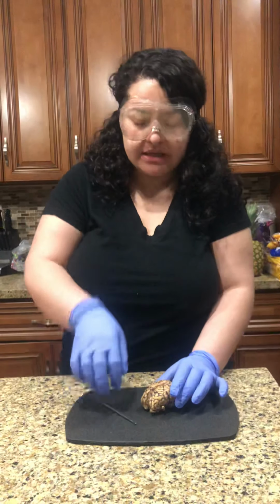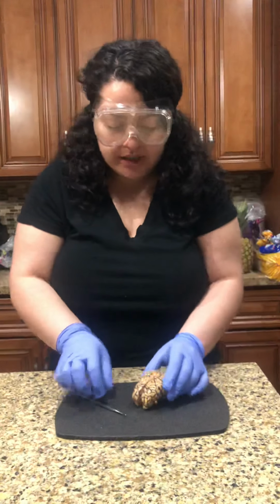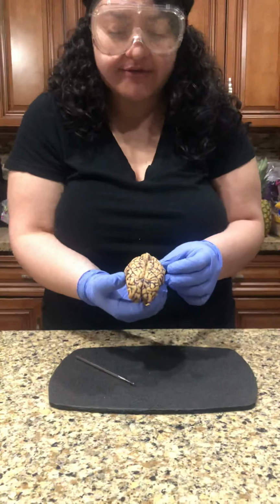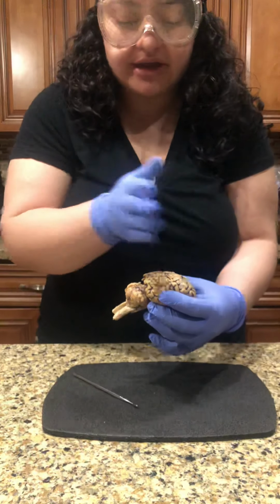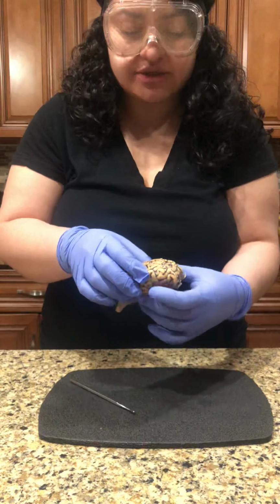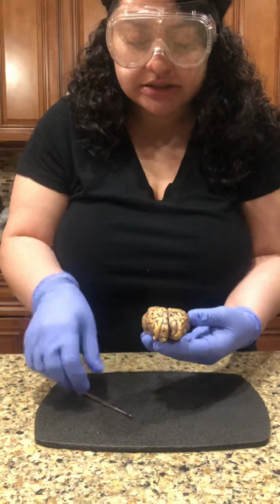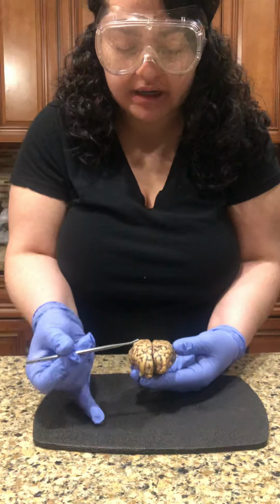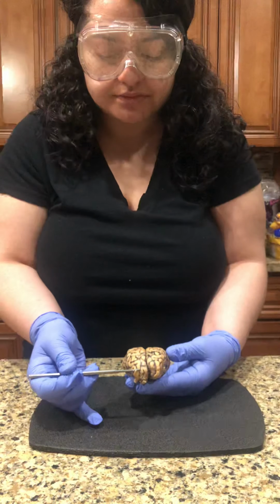So I'll go ahead and be naming 16 parts of the brain, okay? This is the sheep brain I have. This side is the anterior, and this back side is the posterior. I'm not wearing my mask just so you can understand what I'm saying when I'm naming the areas, okay? In the anterior portion, these two areas are the frontal lobes.